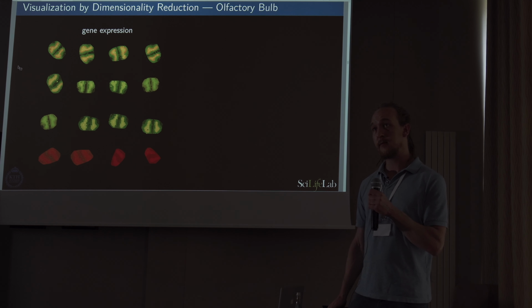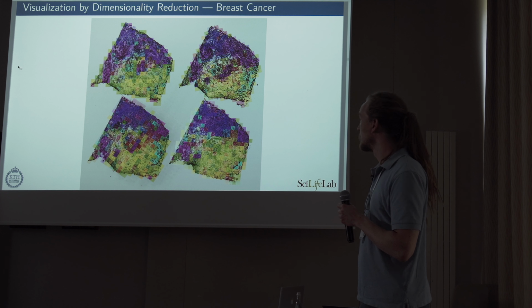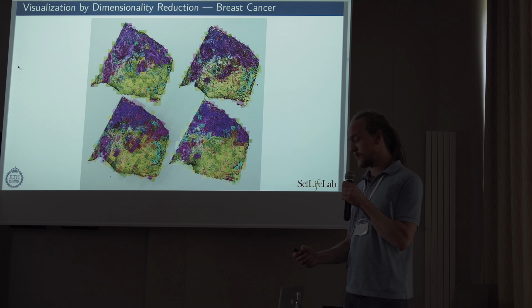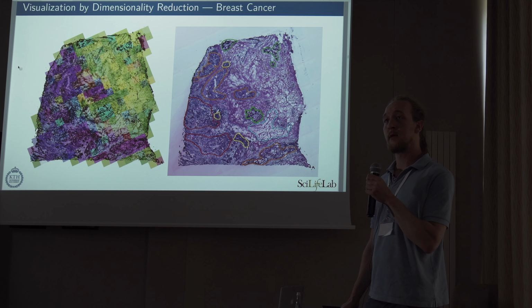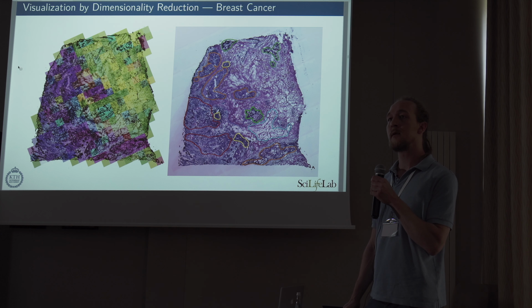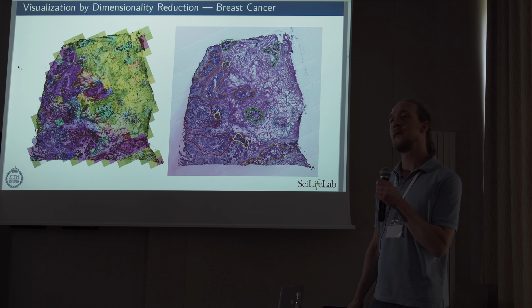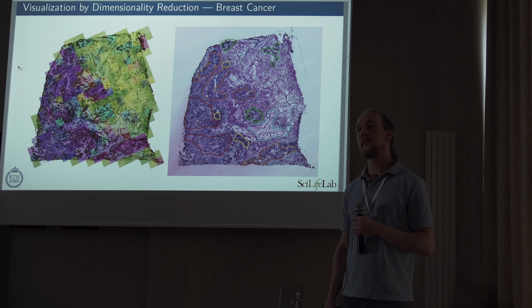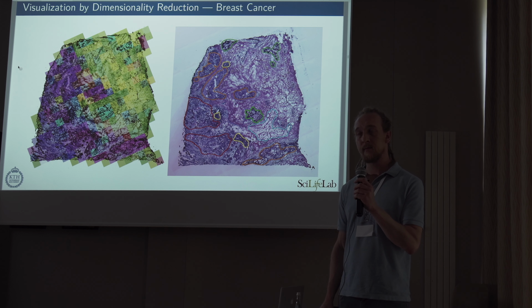Sorry, this picture before, it was from only one slide? No, these are 4 sections, each separate. I mean, but one picture. Yes. Is it from one slide only? Yes. Although a lot of information is lost when you do the single cell process. This is no single cell approach. Also, this is no advanced transcription here.